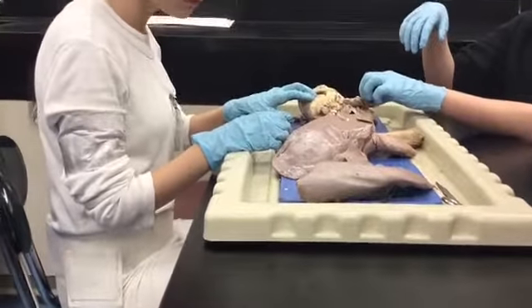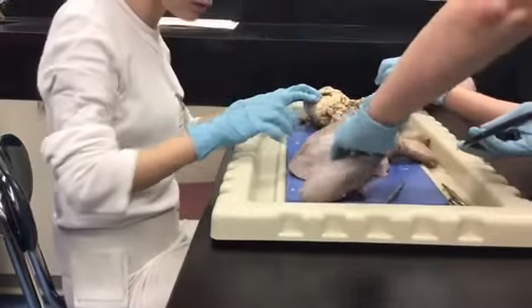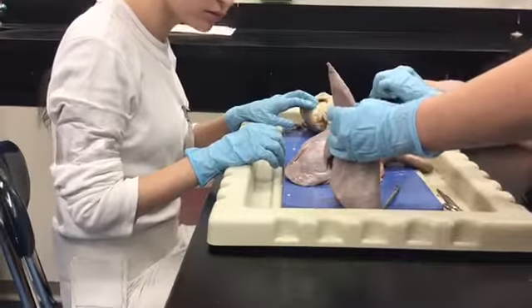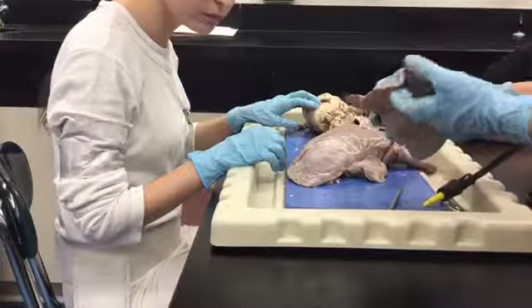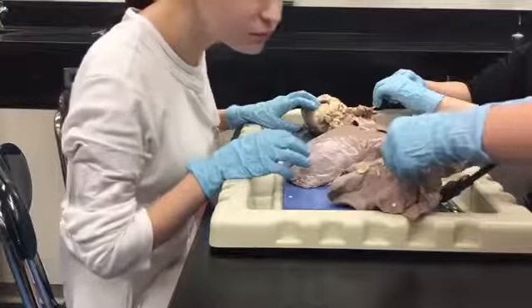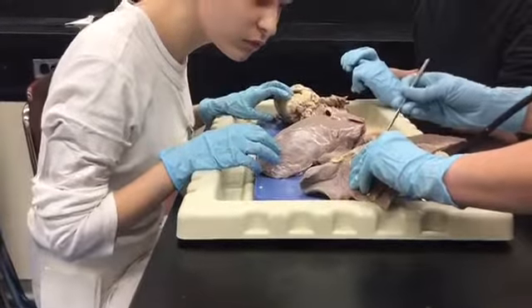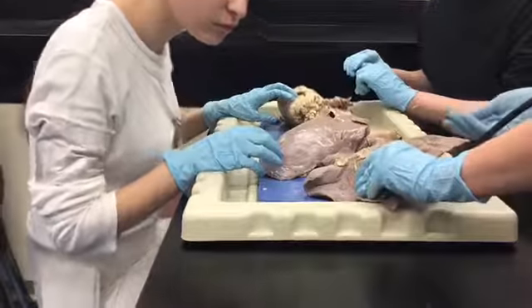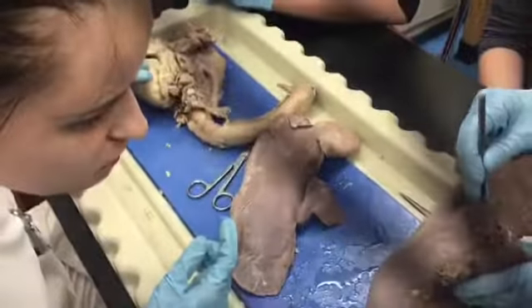No more inflating? Unless you guys want to see that nonsense. How about one more? Okay. Alright, let's look at it. And then did you get the difference between the arteries and veins explained? No. Okay. So when I look here, here is a vein. This thing right here that's all collapsed, that's a vein. Veins are under way less pressure than arteries. So when they're not filled with fluid, they just collapse. You can see it just collapses easily.